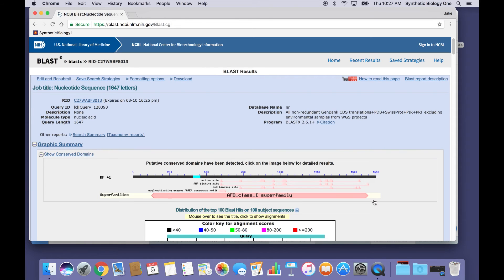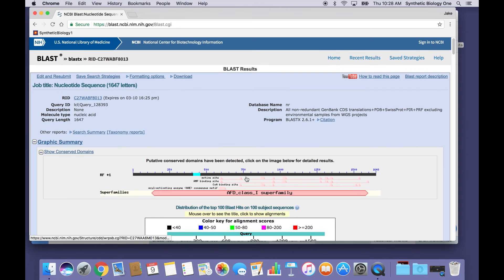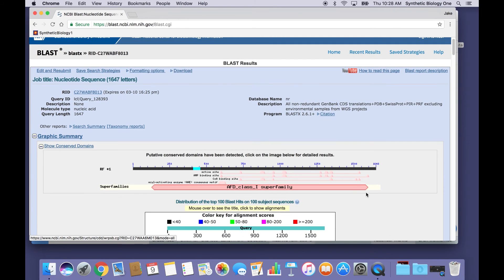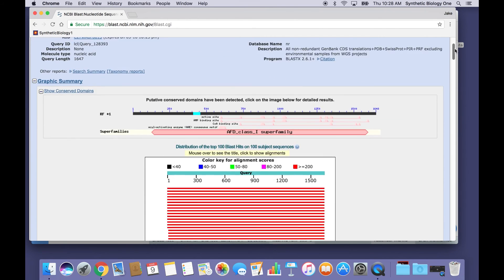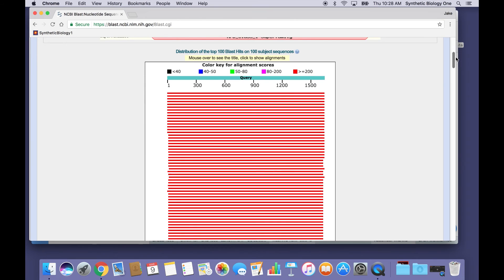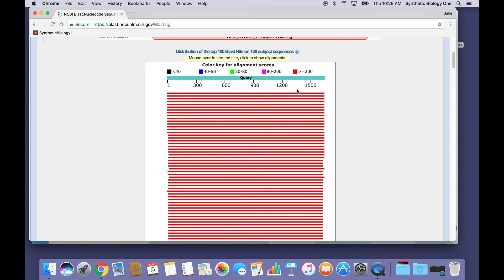So as you can see, there's a ton of information that comes up when you get a blast hit for your search. I'm not going to go over everything. But I am going to pause at this box and see that the red color indicates that our hits are almost perfect.